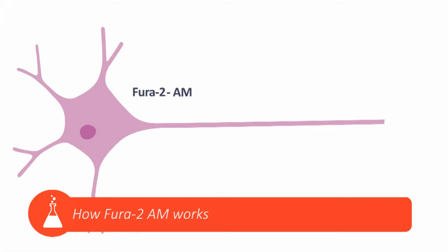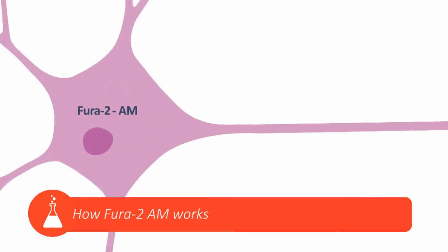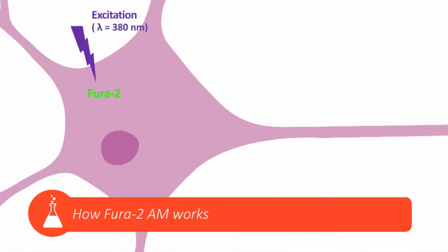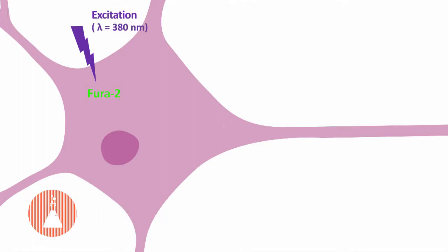Fura-2AM is a molecule that is liposoluble thanks to the AM group. Once inside the neuron, the Fura-2AM molecule will lose its AM group through the endogenous esterases that will break up the calcium indicator, separating this group. Then, the Fura-2 can no longer exit the neuron without the AM group. Under our experimental conditions, the Fura-2 molecules are not bound to calcium ions and emit fluorescence.